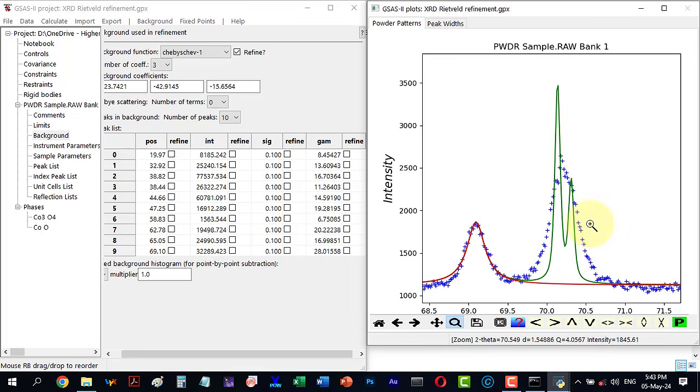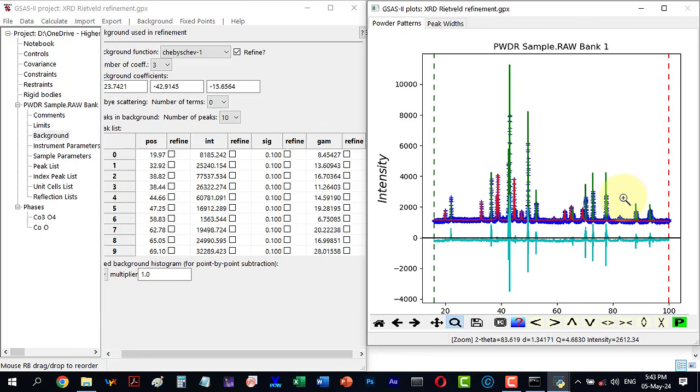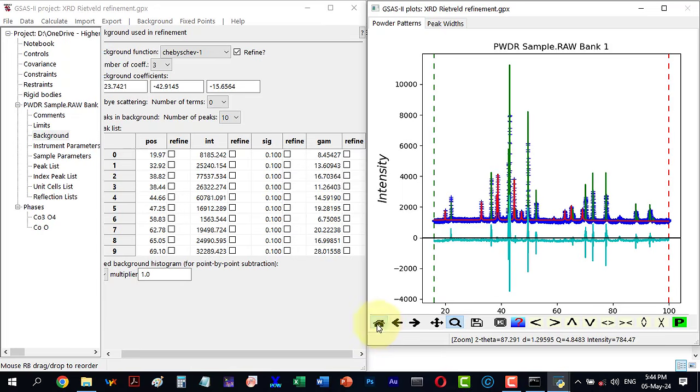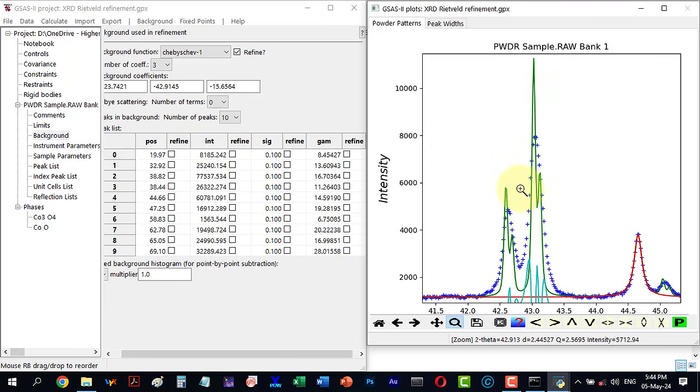Now let's proceed similarly. If I examine this area, it is also not fitting well, showing two peaks instead of one. Furthermore, over here, there seems to be a different structure. Let's concentrate on our primary peak here. This peak is significant and we need to refine it now.